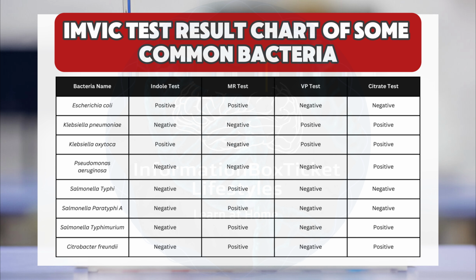Pseudomonas aeruginosa: negative indole, negative methyl red, negative Voges-Proskauer, positive citrate. Salmonella typhi: negative indole, positive methyl red, negative Voges-Proskauer, negative citrate. Salmonella paratyphi A: negative indole, positive methyl red, negative Voges-Proskauer, negative citrate.